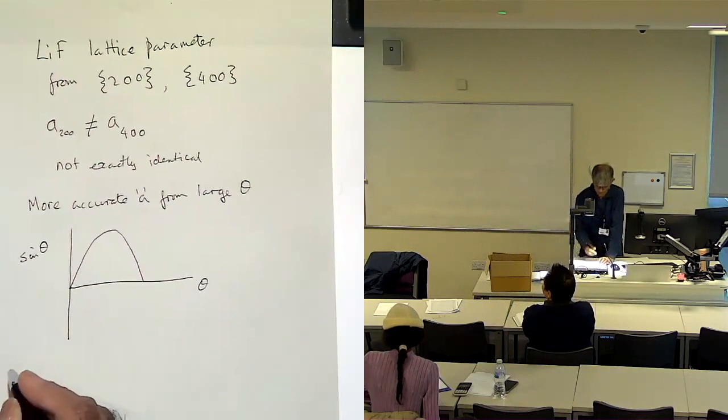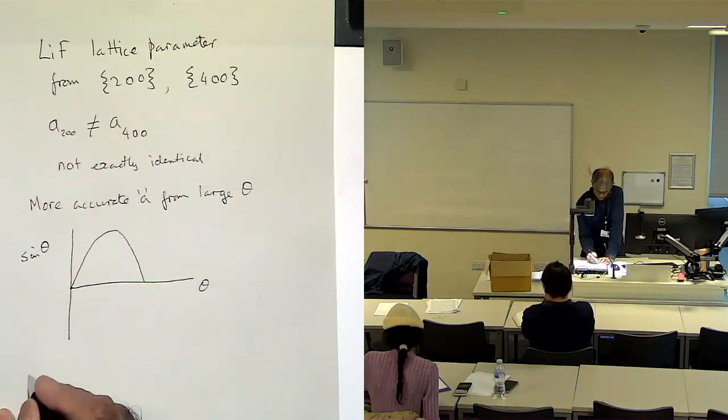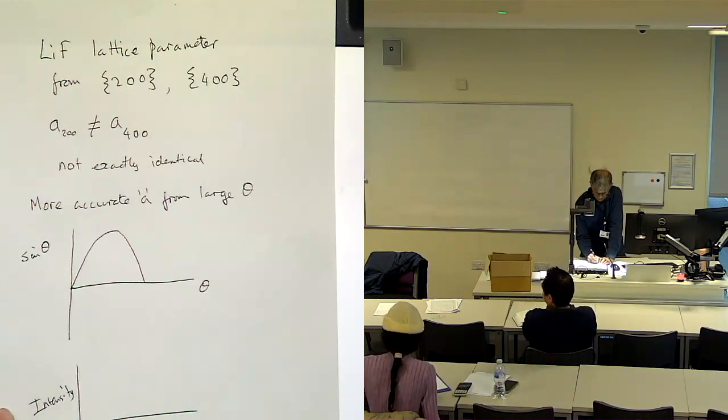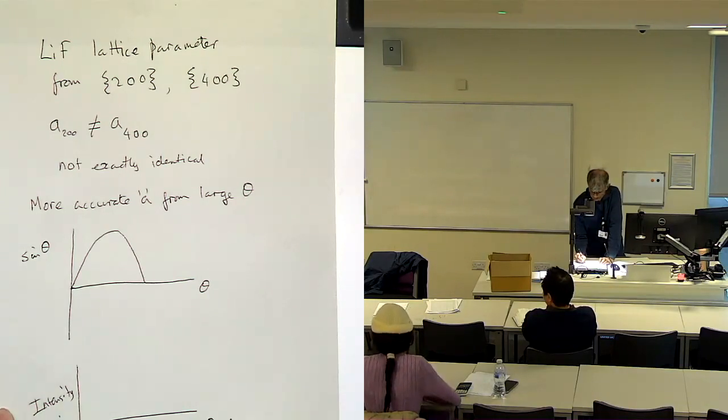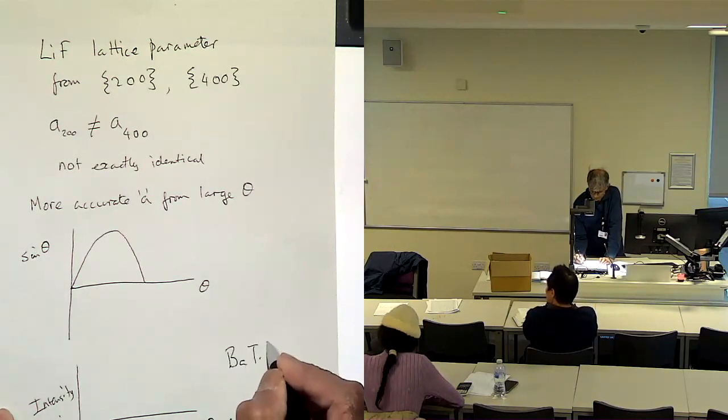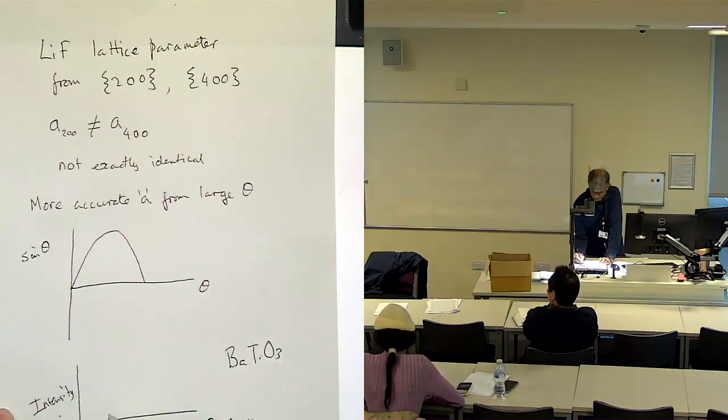The second point was that when you looked at the peak for barium titanate, it was not just broad, right?